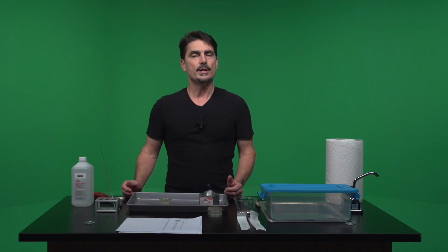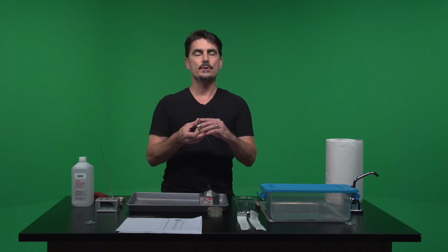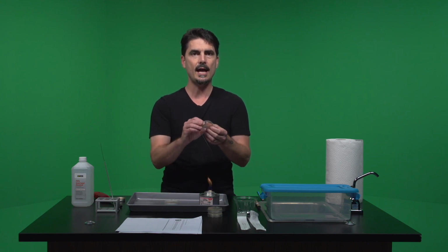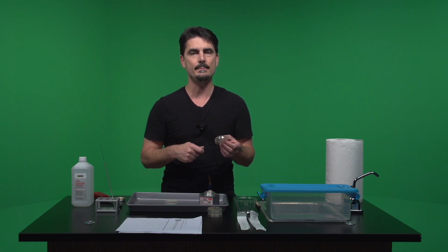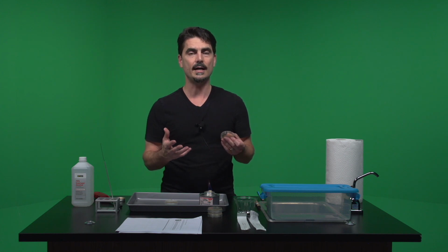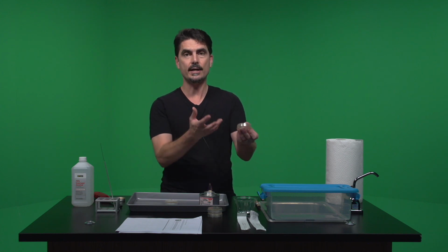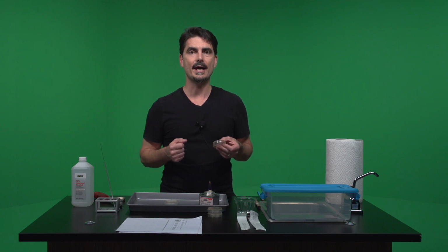And what you want to do is, whatever plate you're using, when you're done, go ahead and look at it, right? It's hard for me to show you in the camera, but look at it to see if it is the same streaking pattern, right, as we did on the board together, which we're showing right here again, so that you can see what your pattern should look like.